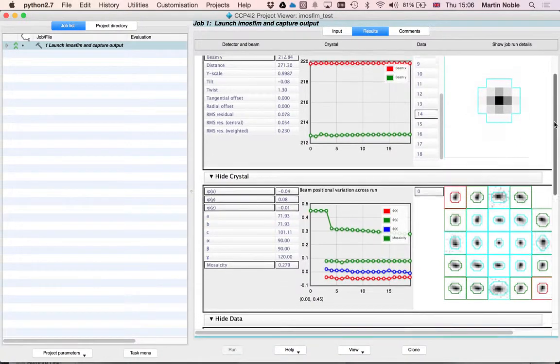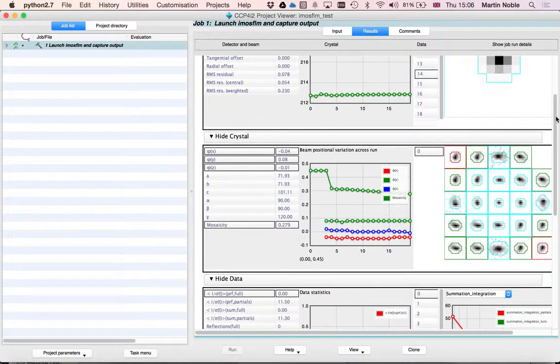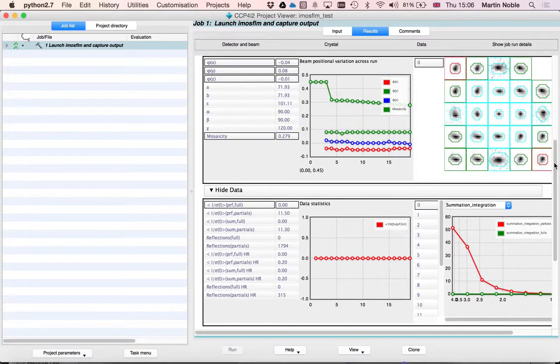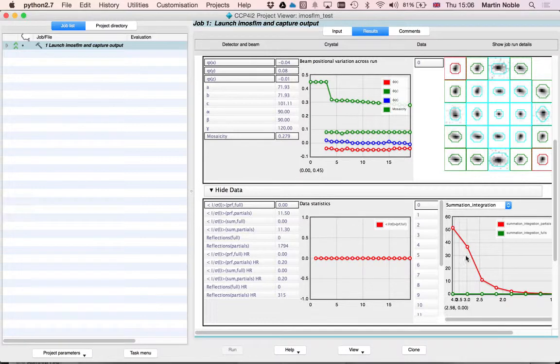This interface lets you have a look at all sorts of things. Here we've got an analysis of the integrated intensities as a function of resolution.